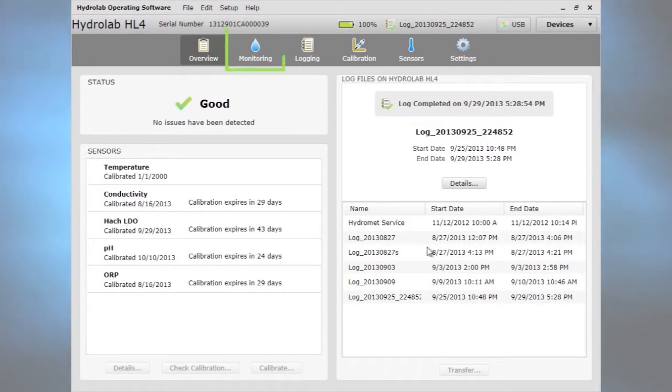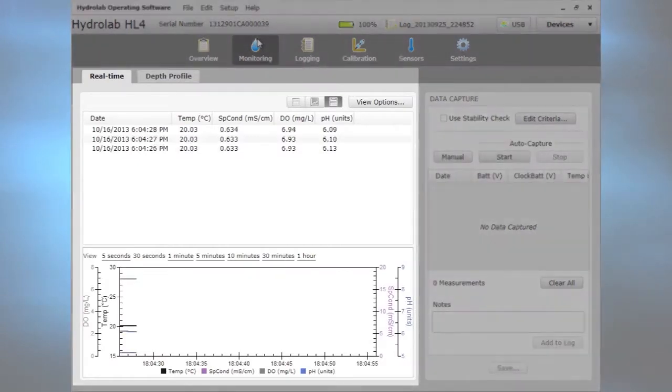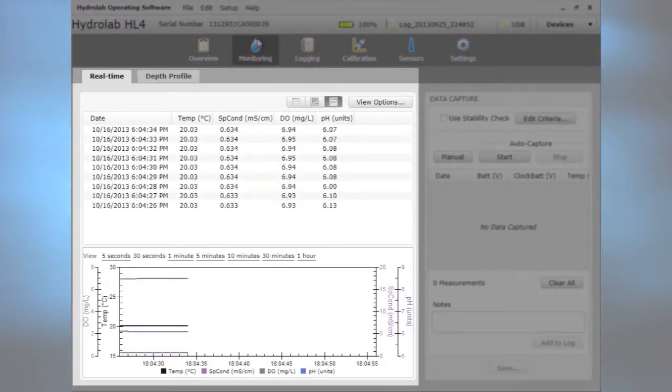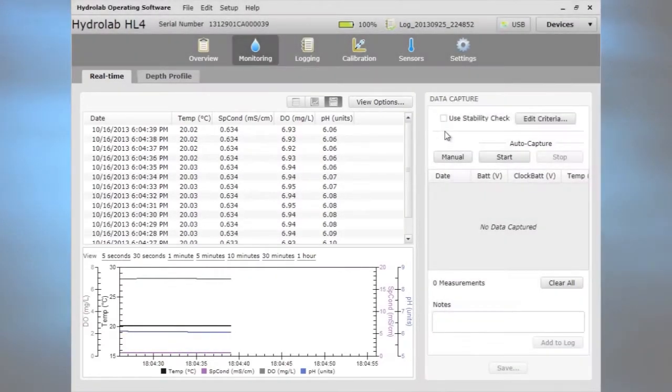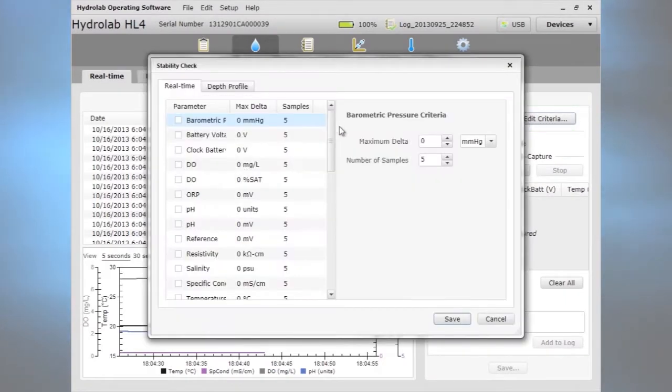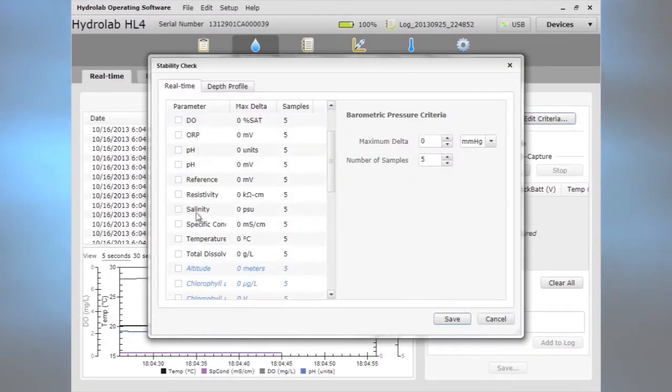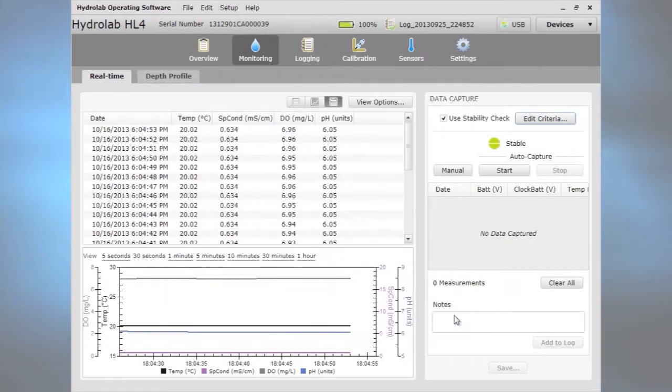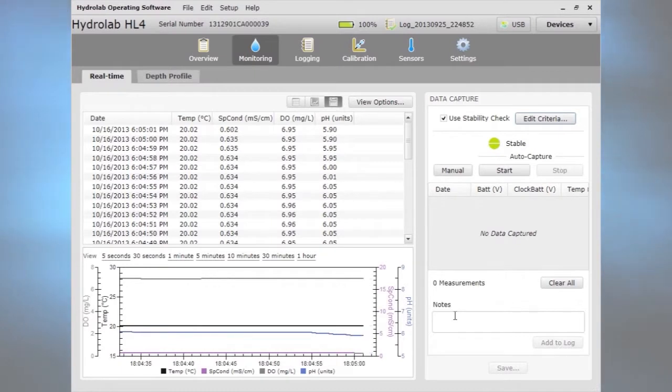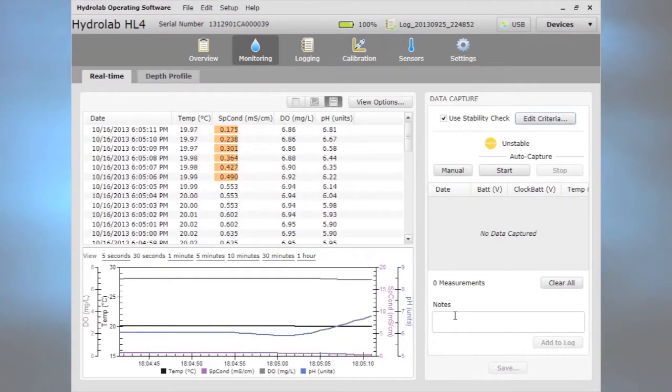Click monitoring to collect water quality data in real-time. Data appear in the left panel. Stability check criteria can be set to tell when data are stable. Unstable data are highlighted in the table.